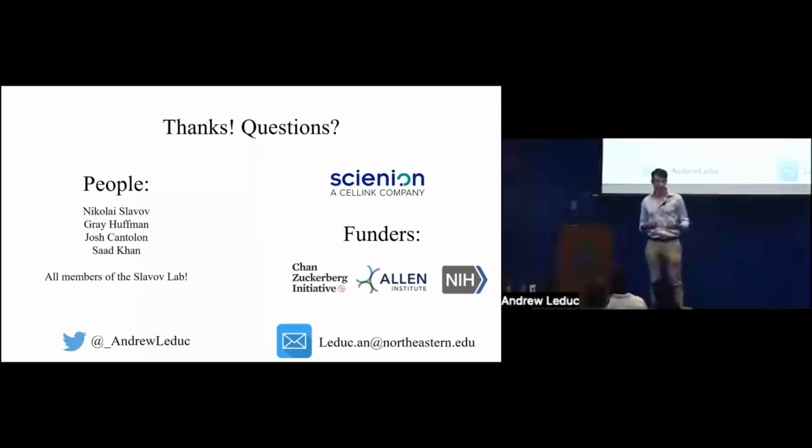So there's always the potential that it could be an artifact of sample preparation, and it's always upon the user and the people doing the work to, to the best of their ability, suss out to what degree these different potential sources of batch effect, be it different days the mass specs are run, different days your samples are run, different instruments. That was actually a considerable source of variability in our data. But yeah, you certainly don't expect those clusters to be totally the same, in the sense that we do think there's some additional heterogeneity in those melanoma cells potentially coming from a subpopulation.